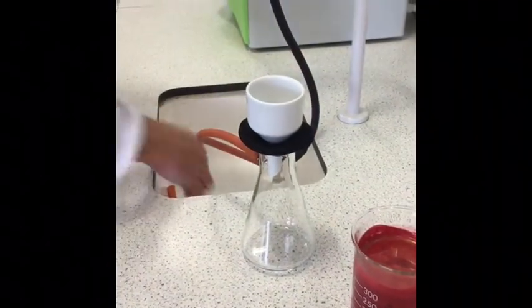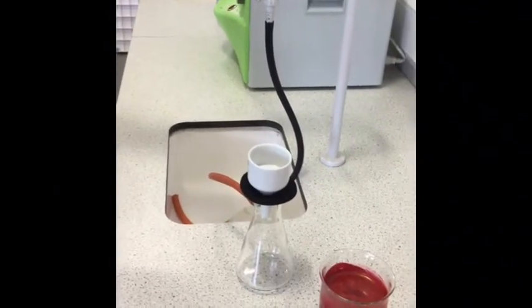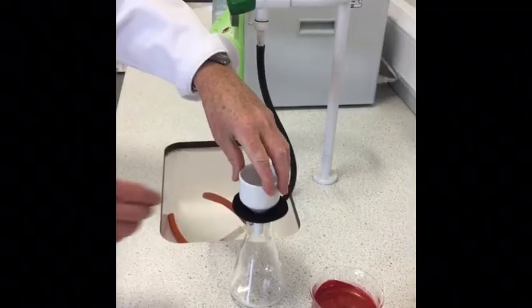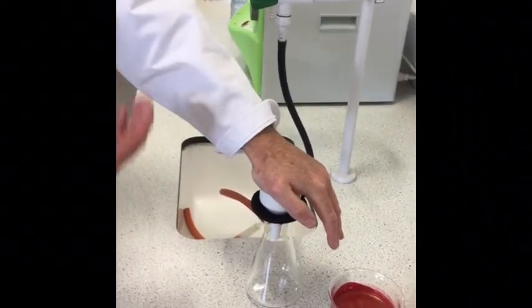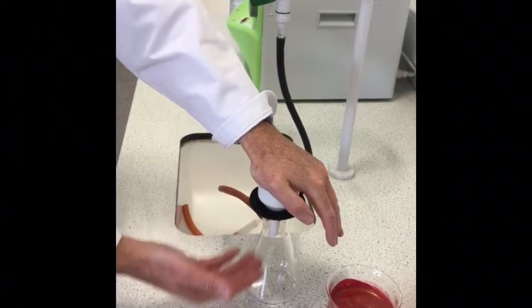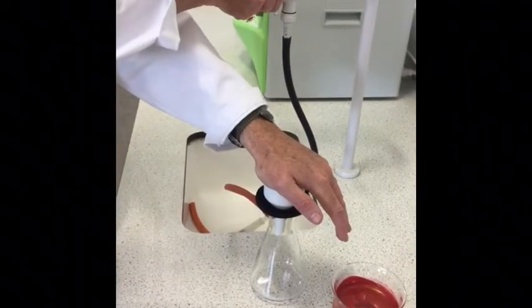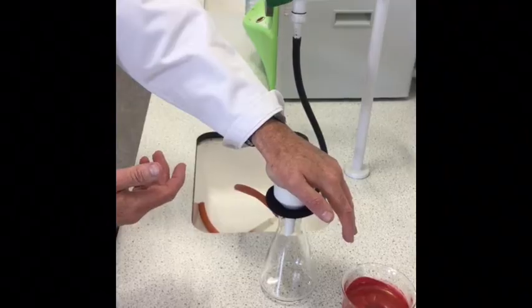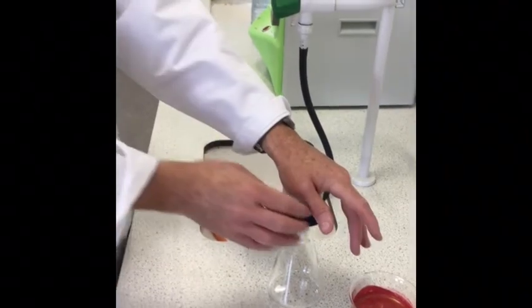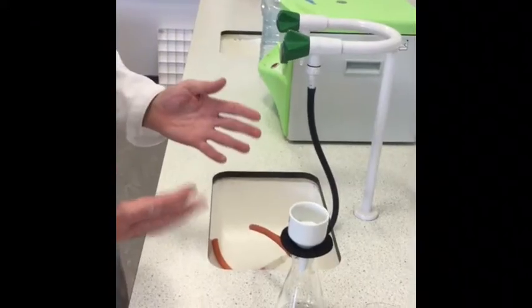Turn the tap on. And if you press this down gently, you'll feel the vacuum pulling the solution through. The more you turn on the tap, the stronger a vacuum you'll get. If you turn the tap on too much, this pipe will come off and soak you. That almost inevitably will happen.